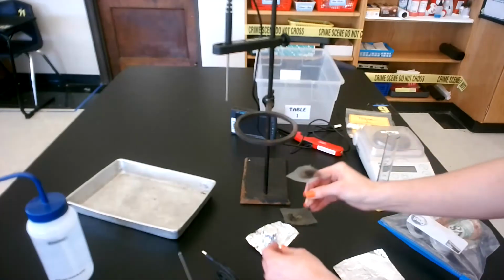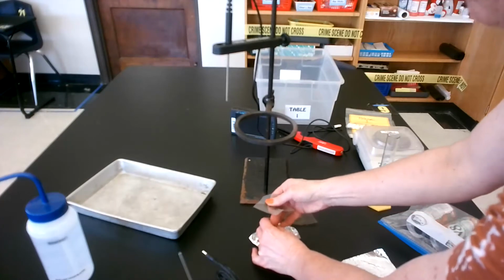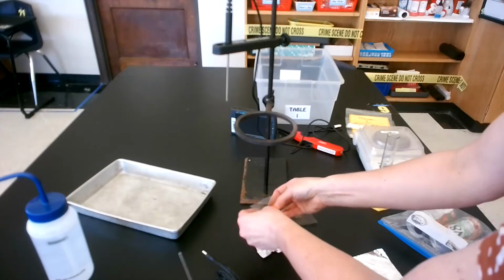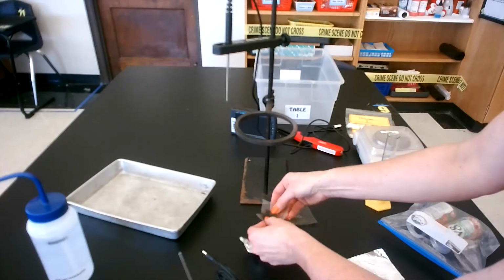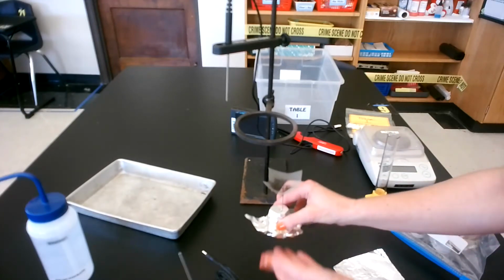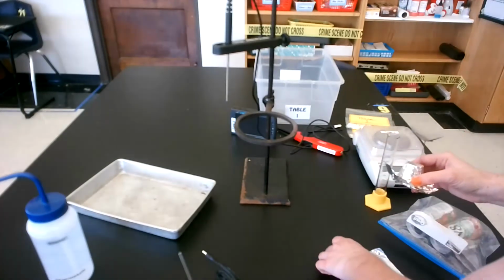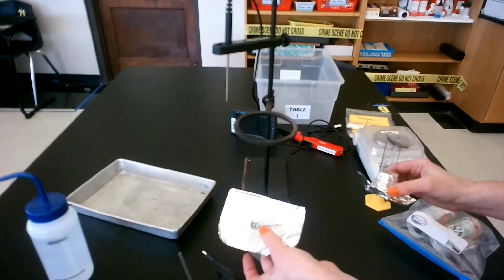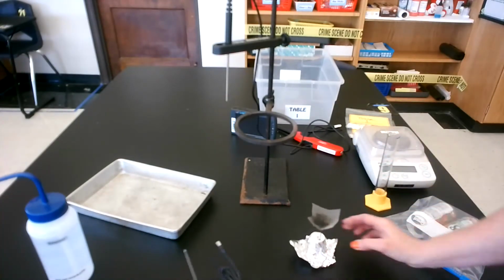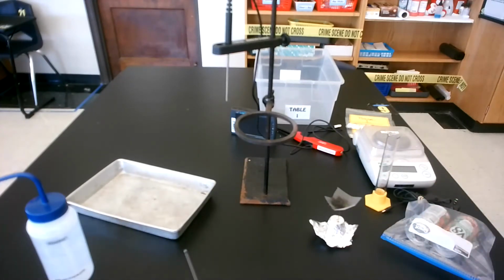I'm going to put that paper clip into the cork, and some of them have soft spots, so I just need to find a spot and then push it in just a little bit. Then I'm going to bend up so it makes a little bowl. That way nothing rolls off, nothing falls off. So this is my food holder, okay? And then when I switch to my second food, I will use these new materials and the cork to make my second food holder. What I need to do is, let me get to my electronic balance.